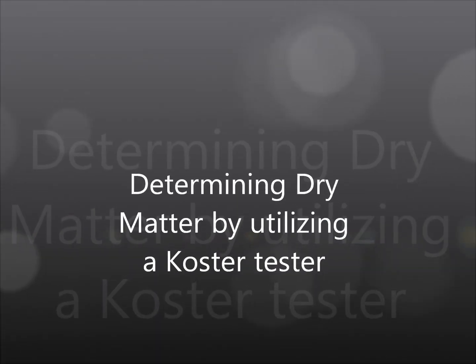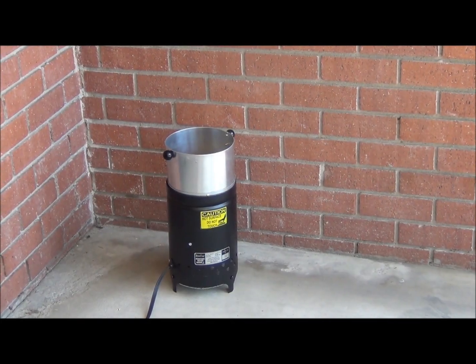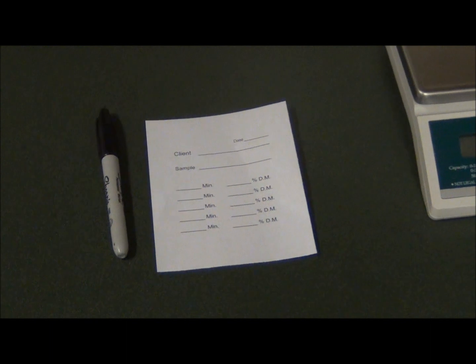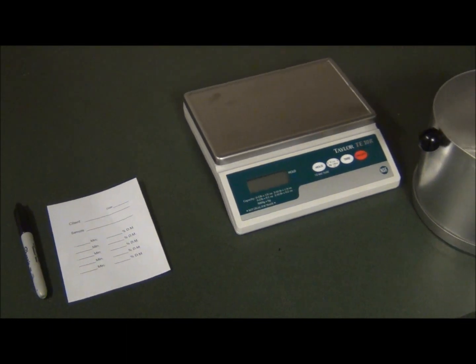Determining dry matter of wet feeds by utilizing a Koster tester. There are multiple ways to determine dry matter for wet feeds. This is an instructional video of the step-by-step process of drying, in this example corn silage, using a Koster tester.